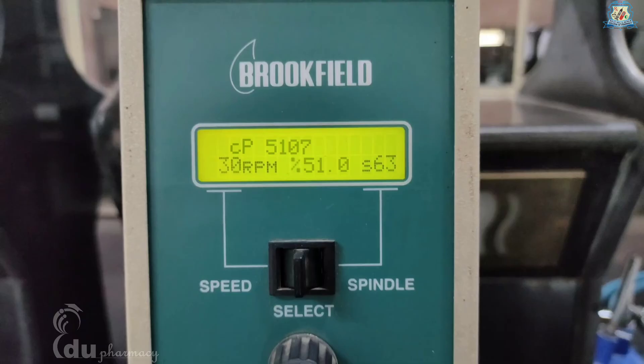The percentage torque must be in the range from 10 percent to 100 percent for any combination of spindle and speed rotation. If percentage torque is below 10 percent, it is considered under range — you may increase RPM or select a larger spindle. When percentage torque readings exceed 100 percent, it is considered over range; the display changes and shows an error. In this case, you may decrease RPM or select a smaller spindle.